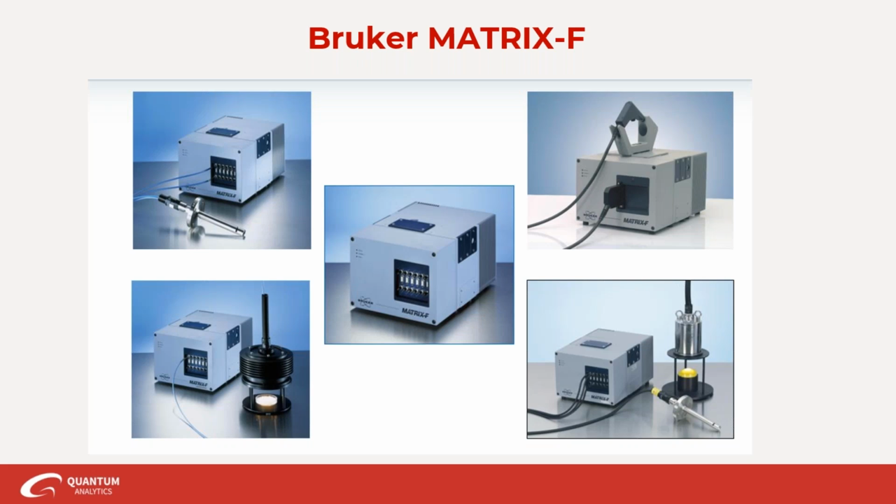So on the top left, we have the transflectance probe. So that's used for process liquid measurements. You see the little gap there, the liquid would go in that, light passes through it, reflects off the mirror, back through the sample and back to the detector. On the top right, we have the handheld reflectance probe. That is really good for raw material ID, and there's also a transmission version of that as well. And then across the bottom, there's 2 Q412 non-contact probes.